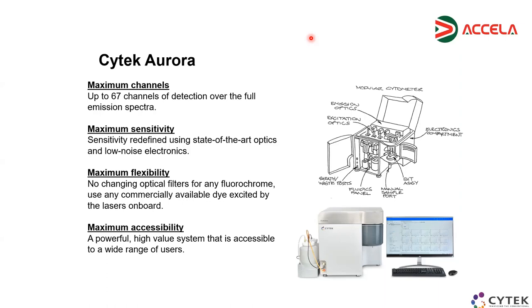Yeah. Okay, so that's another good question. There are different options for maintenance. In between samples, especially with very sticky dyes like PI or DAPI, we recommend running something called clean flow cell. There is a nice wizard which will guide you through it. We use some bleach and Contrad 50%, which is a very nice detergent for the flow cell, to remove all the excess dye sticking in the flow cell or in the tubing. It's really quick, two steps, it takes a minute, but we recommend it if you are switching, for example, from a really bright dye to a totally different panel. So we have this wizard in the software, which we recommend also for unclogging the instrument, because it can happen. So we use the Contrad also for unclogging, the Contrad 70.